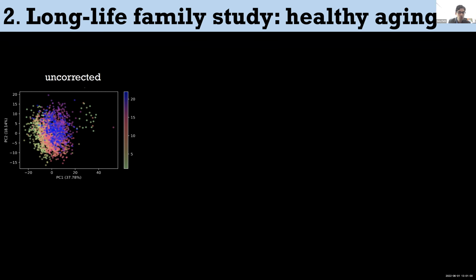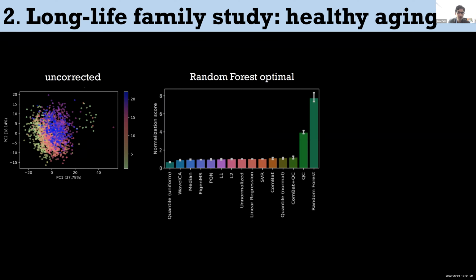This is a quality control sample, which is a pooled sample that we made by taking small aliquots of the individual samples. And then we evaluated different approaches, at least the approaches that are existing. We didn't have our hands on some of the stuff that the other DTC groups are doing, but we're very excited to hear about that. But some of the other normalization approaches that are out there.